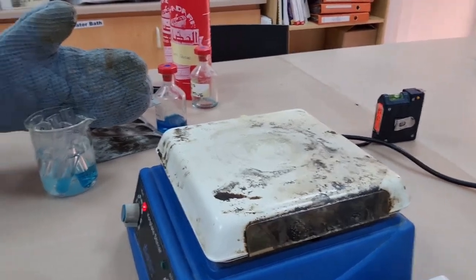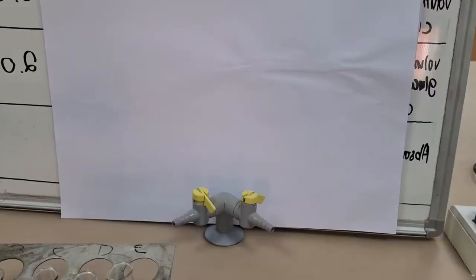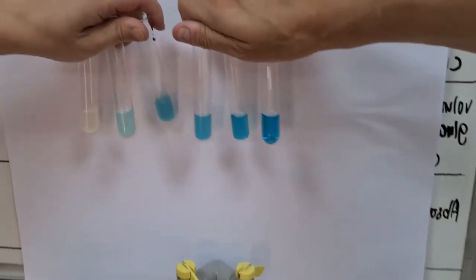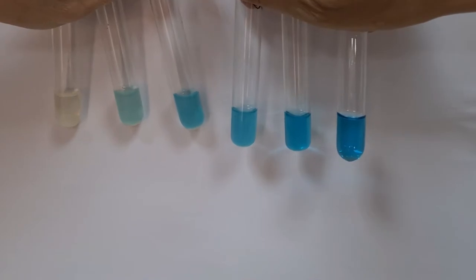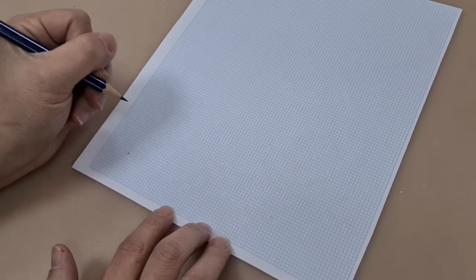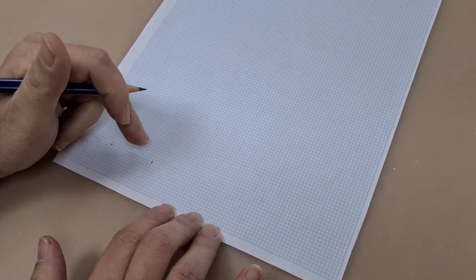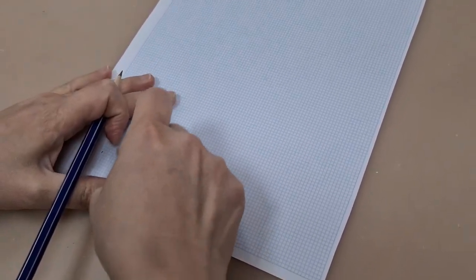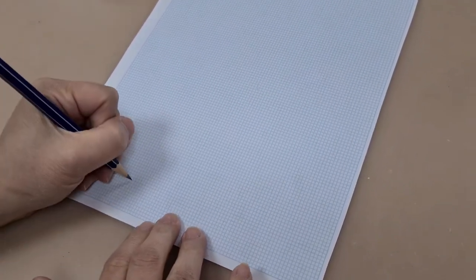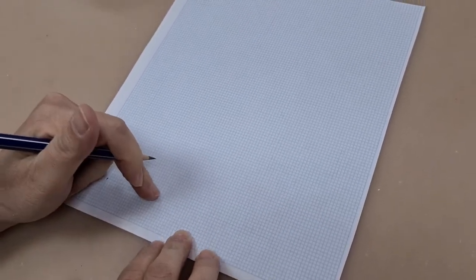We're now going to measure these in a colorimeter and plot the absorbance on the y-axis against concentration on the x-axis. We've measured the absorbance in the colorimeter and now we're going to plot the graph remembering the concentration of our knowns is going to go on the x-axis.